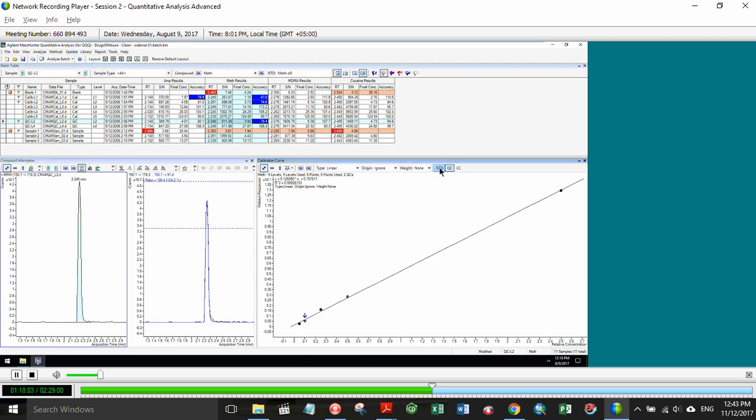As Steve mentioned, we can turn on and off our points there, add the internal standard, see how uniform those are across the different runs and standards. Currently, we've got the QCs shown.